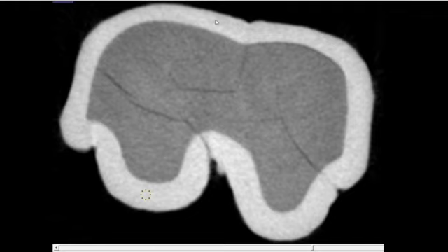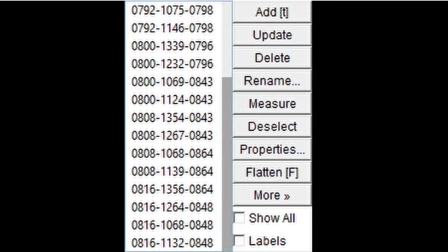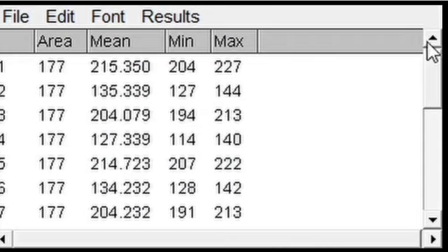And for the dentine, again, it's roughly halfway to the middle of the tooth, or if the pulp chamber is visible in the slice, roughly halfway to the pulp chamber. And you do the same for the lingual, and then you do it for 4 more slices, so a total of 5 slices. So 4 values for 5 slices, so 20 values in total. And from this, you'll find the average value for the 10 enamel values and the 10 dentine values. So you click on measure in ImageJ, and then you just find the average value for each.